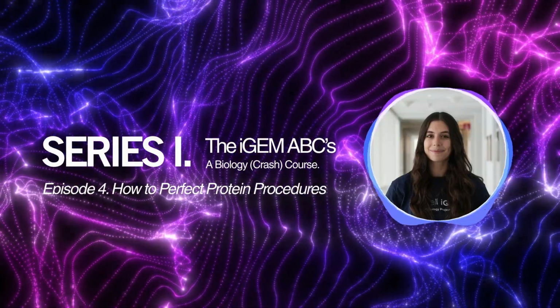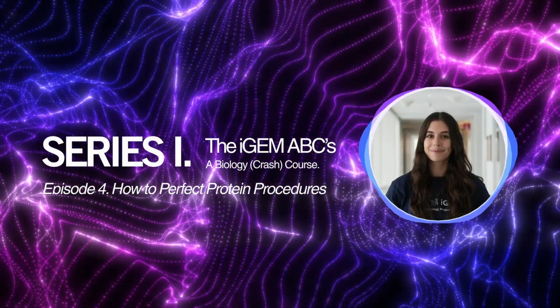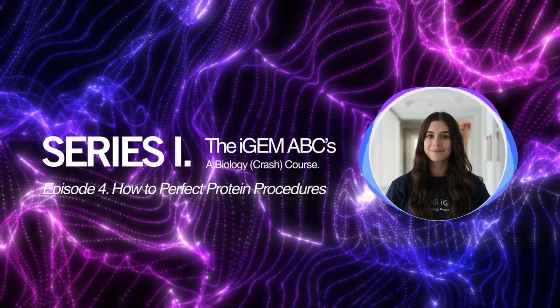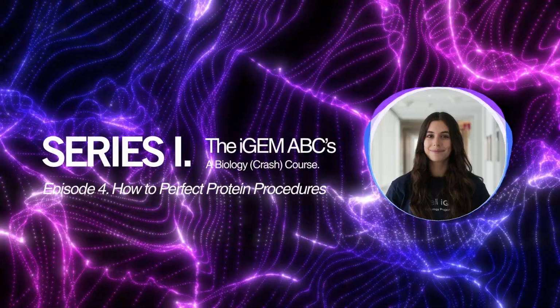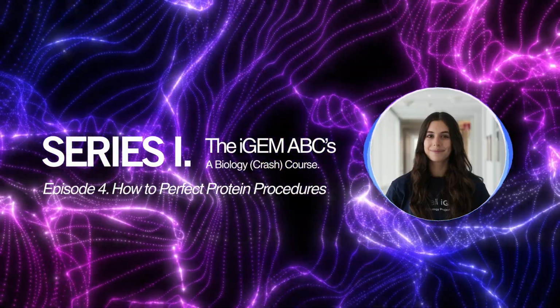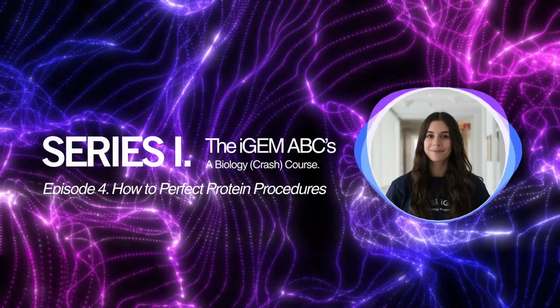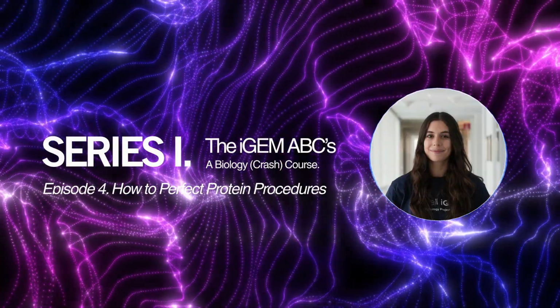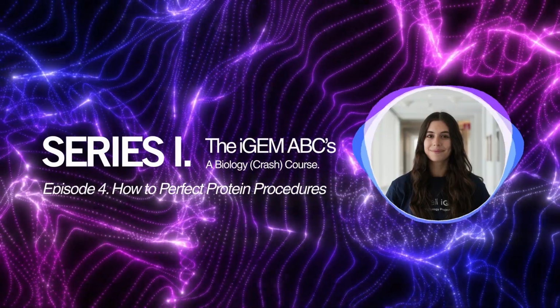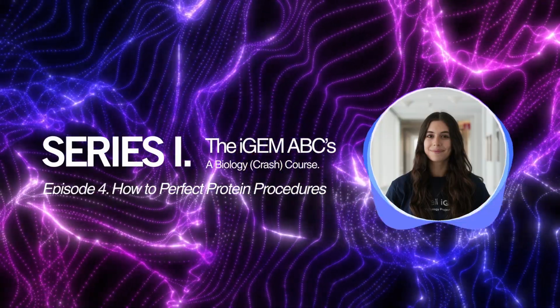And this can be difficult, so it's where the process of lysis comes in. Bacteria are typically lysed using two methods, which can sometimes be applied in combination and sometimes have to be done in isolation or selected very carefully to make sure that you're keeping the protein safe as you lyse and break open these bacteria. The first method is called mechanical lysis, where, as the name suggests, the cell walls and membranes are disrupted under intense mechanical stress.